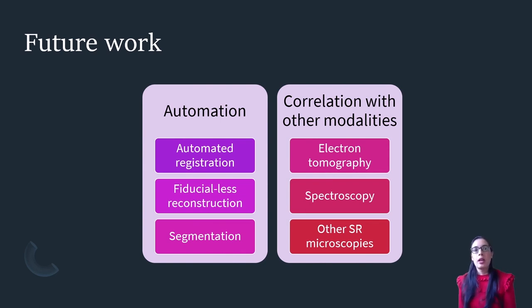For future work, we'll focus on automation of the processes, such as for reconstruction and segmentation, and we'll also be looking into automated registration techniques. We'd also like to use this in conjunction with other modalities, such as electron tomography and other microscopies.